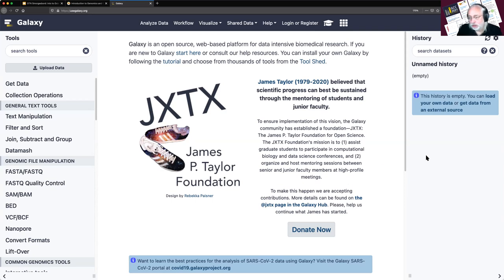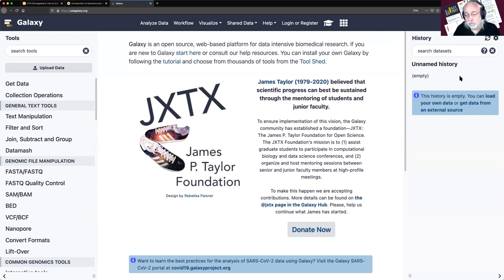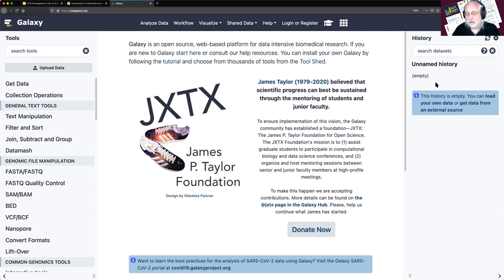On the right-hand side is our history panel, which shows us what work we have done so far. As we do work, it will show up in this panel as a box — hopefully a green box, which means it was successful. New work is inserted at the top and older work gets pushed down. So if you're a computer person, this is a stack. In the middle is where we look at data and where we set up and run tools.